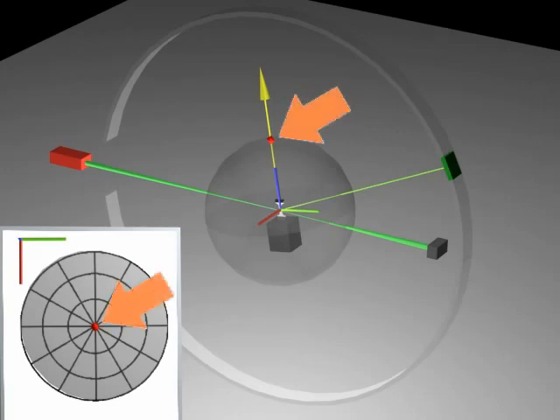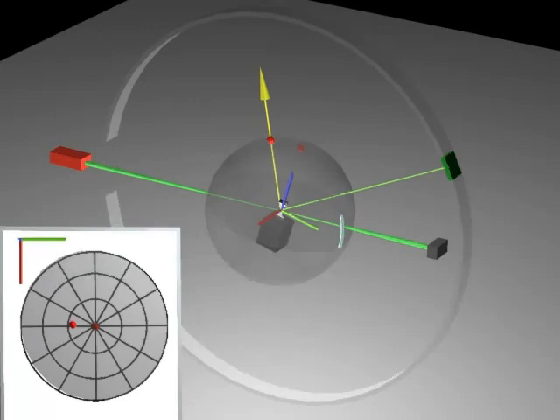on the pole figure. To fill in the pole figure for this set of crystallographic planes, we must collect data for different scattering vectors. This is done by rotating the load frame and sample while keeping the detector fixed. Note that each time we examine a new scattering vector, we are measuring the average signals from the subset of crystals that satisfy the Bragg condition in the new sample orientation. For the pole figure to be statistically relevant, these subsets must be sufficiently large, particularly if we are after lattice strains.